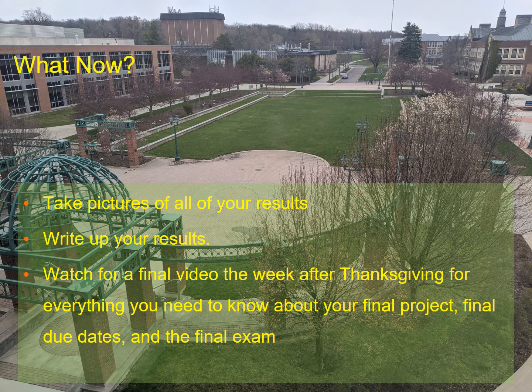So where does that leave us? Well, make sure that you come back after 24 hours to take pictures of all of the results that you've collected this week in lab. And then you'll have a couple weeks to write up your results. Make sure that you take enough pictures so that you've got some things to edit. Make sure that they look really nice. Crop and zoom your microscope pictures. Make sure that your images show exactly what it is that you're trying to tell your audience during a presentation.